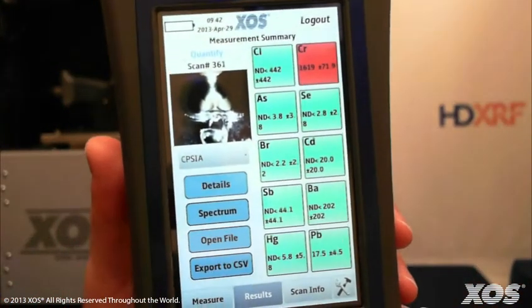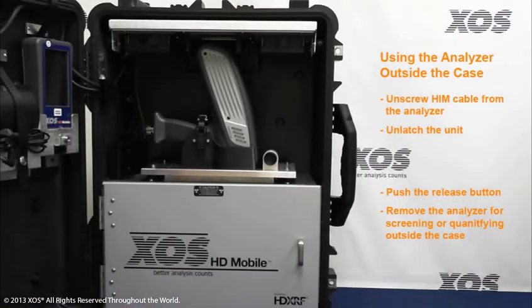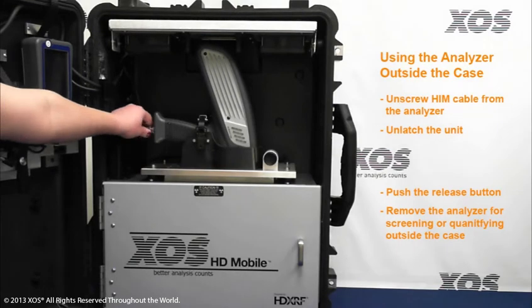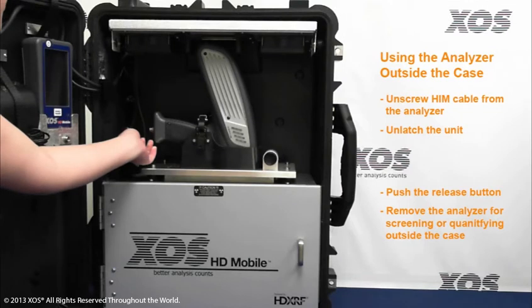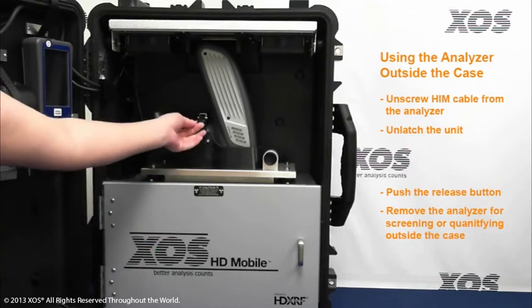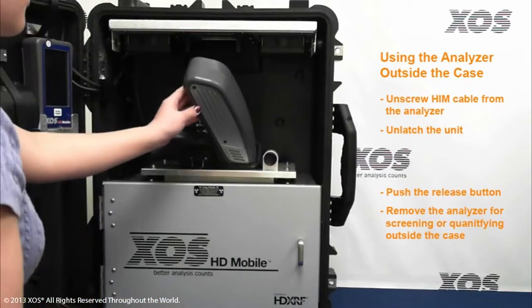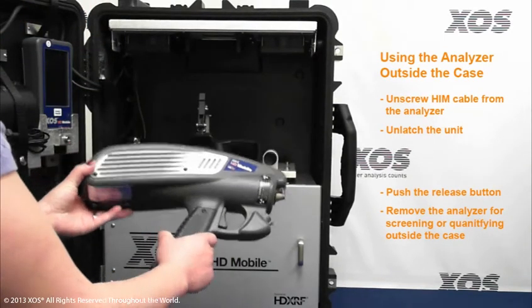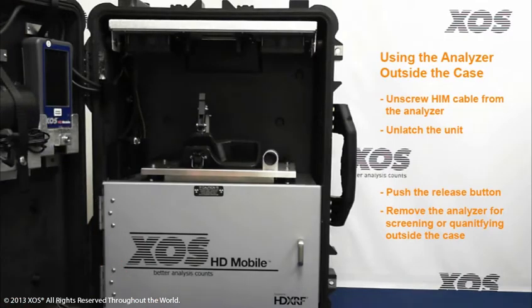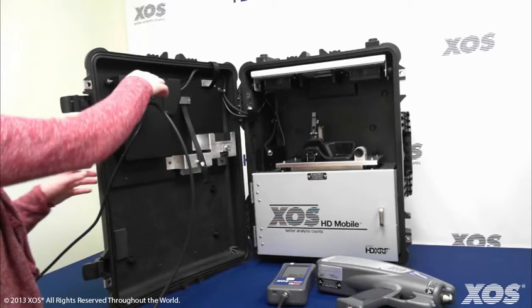It's also easy to remove the HD Mobile Analyzer from the transporter case and use it in handheld mode. Simply unscrew the cable from the base of the gun, then unlatch the unit and push the release button. The gun will fall forward and can be removed from the case. Next, unscrew the cable connecting the human interface module, or HIM, to the transporter case and reconnect it to the base of the gun.